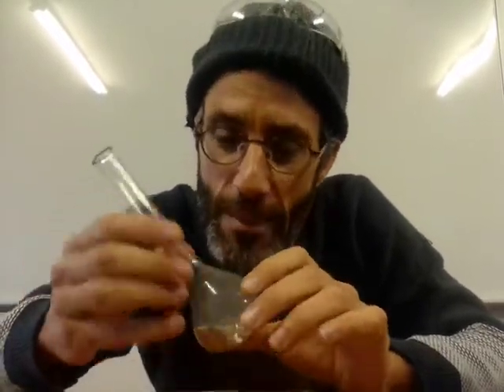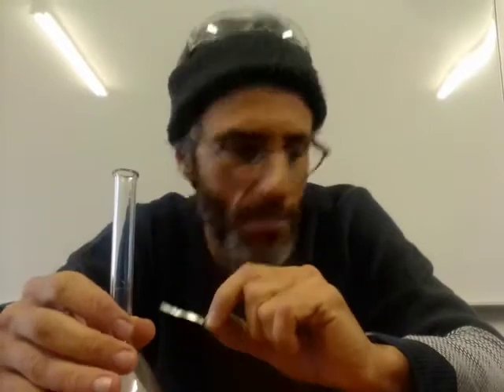Girls, this is our third lesson this week, and today we're finally going to look at our first chemical reaction. Okay, we're not going to use bases today, but we're going to look at acid. We've got quite a strong hydrochloric acid here, and I'm going to drop into it a piece of magnesium. So this is a chemical reaction between acid and a metal.